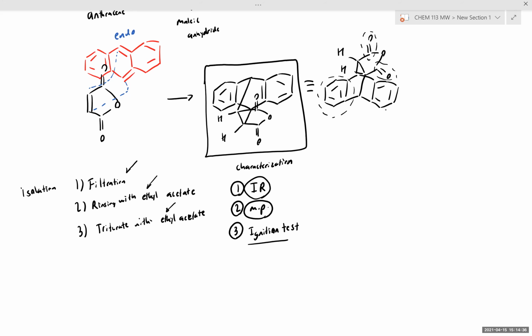So in terms of practically, this Diels Alder lab and the substrates have been chosen to help minimize issues with different stereoisomers being generated, different regioisomers being generated, and we generally only isolate this single product from the reaction. We'll characterize the product using 3 standard methods: spectroscopy, physical property measurement, followed by chemical tests. And then we'll summarize the yield and purity of our product using this data.